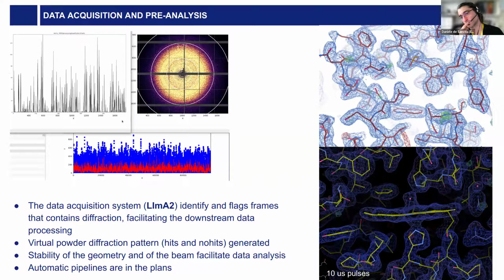Not necessarily, because of course what you present are always the best diffracting cases. It really depends on the sample preparation. A crystal is a crystal, whether it's smaller or bigger. For sure, what we don't have in this kind of measurement are possible additional defects which are added by cryocooling or by cryoprotectant. But we have seen cases of nice small crystals not diffracting, as we have seen cases of ugly crystals diffracting very well. So crystallography is always crystallography. The aleatory part of it.